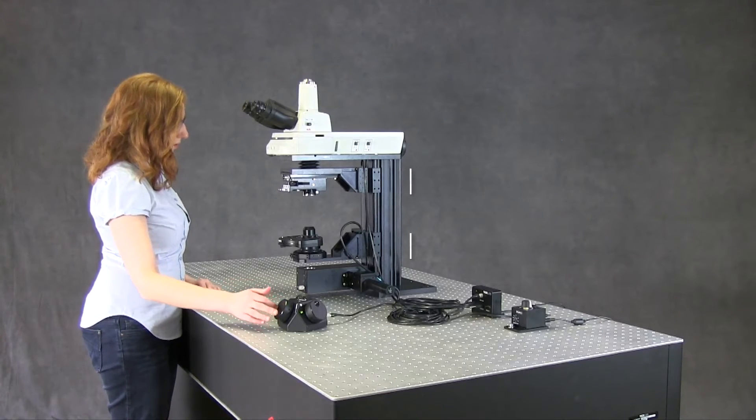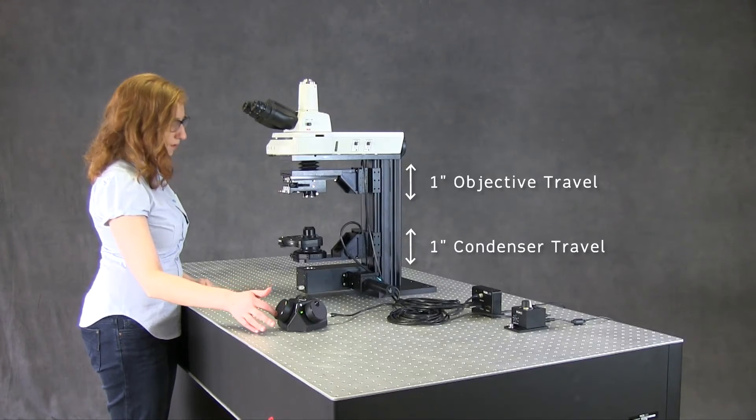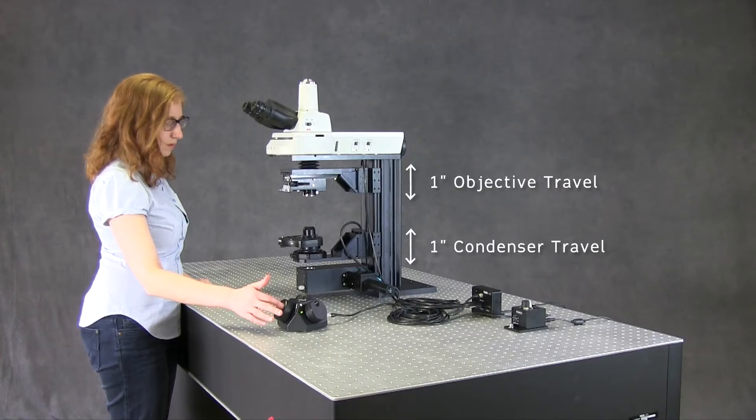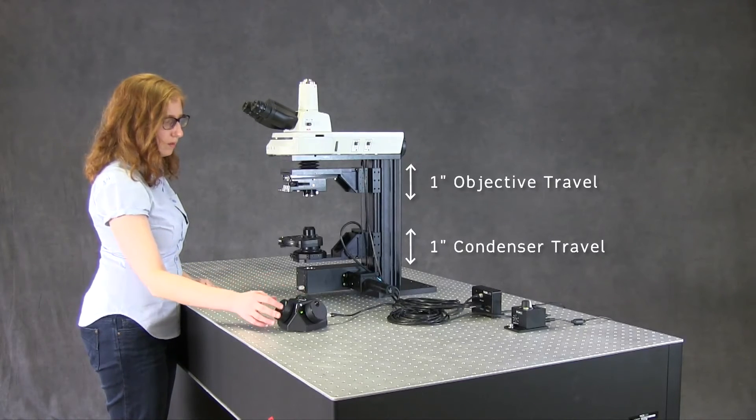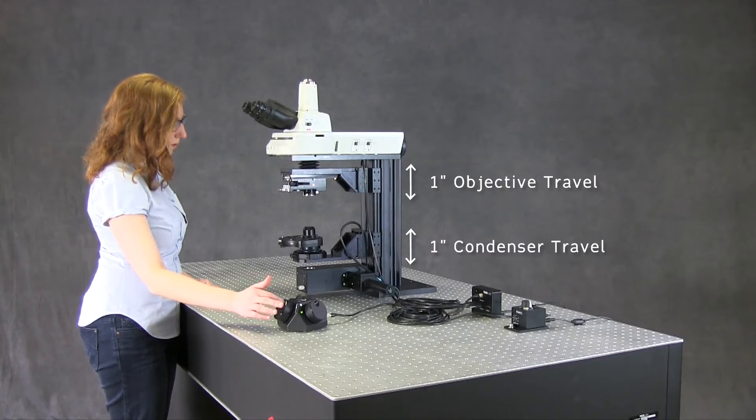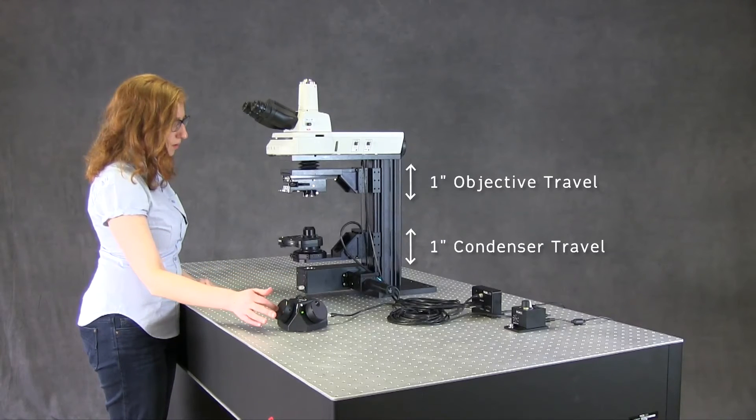The objective and condenser arms are each motorized with a 1 inch travel range. A knob on the top of the controller adjusts the speed of the translation from fast, coarse movements to micro-stepping for fine focusing adjustments.